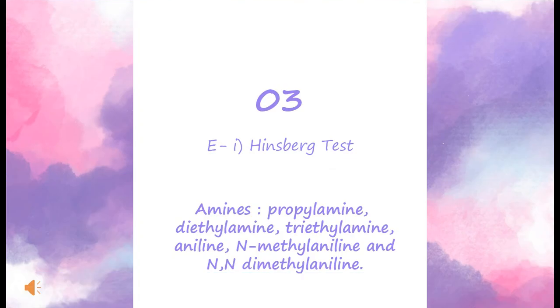Now the third test is from section E, which is amines, and the test is called the Hinsberg test. The amines involved in this test are propylamine, diethylamine, triethylamine, aniline, N-methylaniline, and N,N-dimethylaniline.